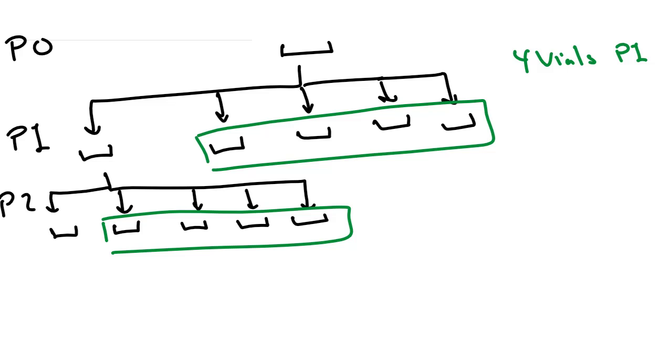Okay. And I go ahead and I have now 4 vials at passage 2, right? Now I can keep going like this. Now I'm being very conservative here. I'm only doing a 1 to 5 split. I can do a 1 to 10 split.